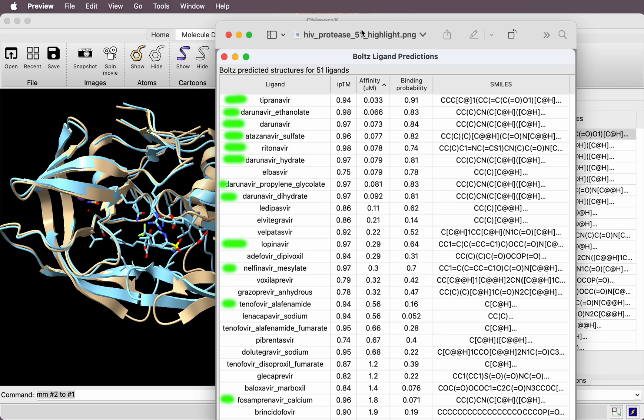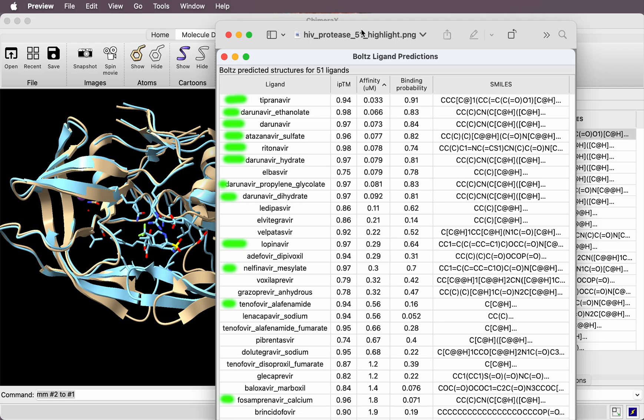This is an unusual situation because there are a lot of HIV protease structures with bound drugs in the PDB that were used to train Bolts. If you're running predictions on novel drugs not in the PDB, or on binding pockets not found in the PDB that Bolts was trained on, you can expect prediction results to be much worse.